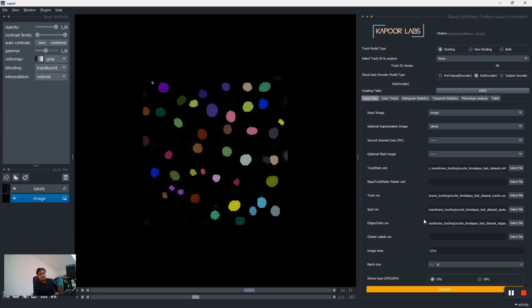out of Trackmate. And right now, you see that there are a lot of empty fields because in this particular mode, we are just taking the outputs that come from Trackmate. We hit this orange button and it's going to extract the properties of all the tracks from these XML file, and then it's going to fill up all the fields that you need for actually visualizing the tracks over here. And this is the vanilla analysis of Trackmate.